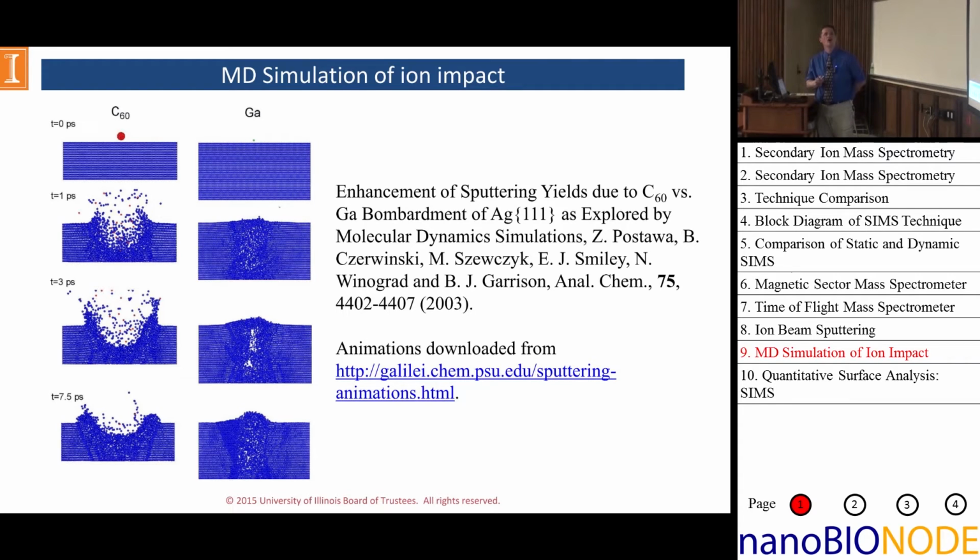And you can see all the things that are coming out. You're having molecules come out, atoms together and all that. And the damage layer is not significantly deeper than the layers that you're going to be looking at material from. The goal of this with C60, this is why people are using the larger cluster beams now, is because you can go to the idea now where I'm going to look at molecules coming out as I go deeper in.